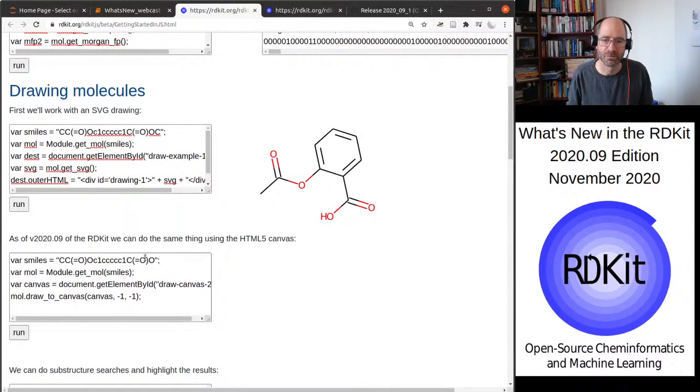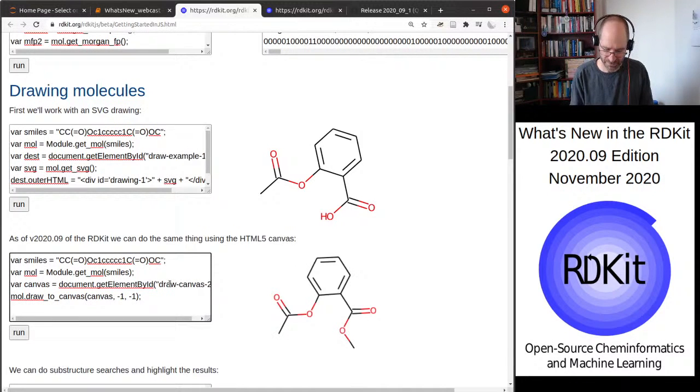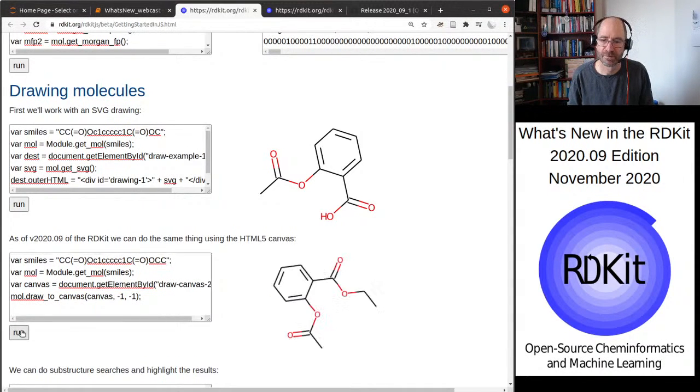That actually didn't work, which is interesting. Try changing here. Do the same thing with HTML5, and you can see now I got a different output. Okay, that's working up top. It's not working. I think this is probably a bug in my ability to work with HTML and JavaScript.